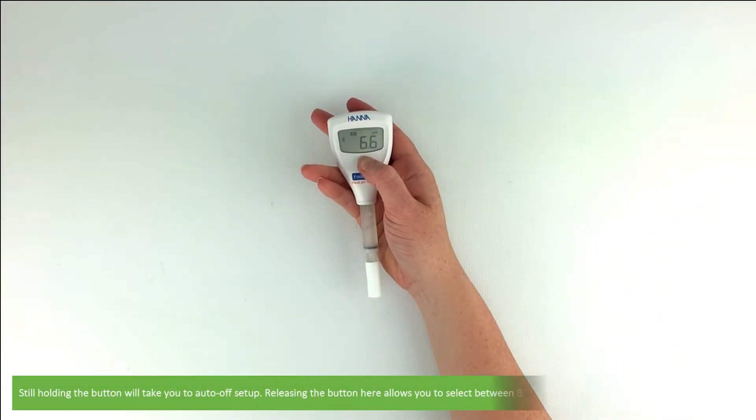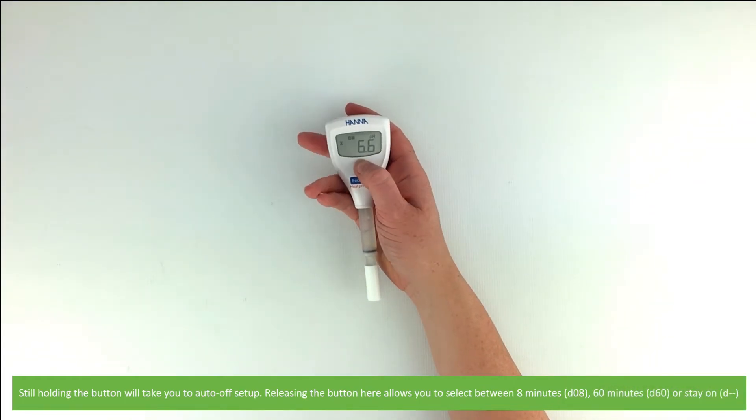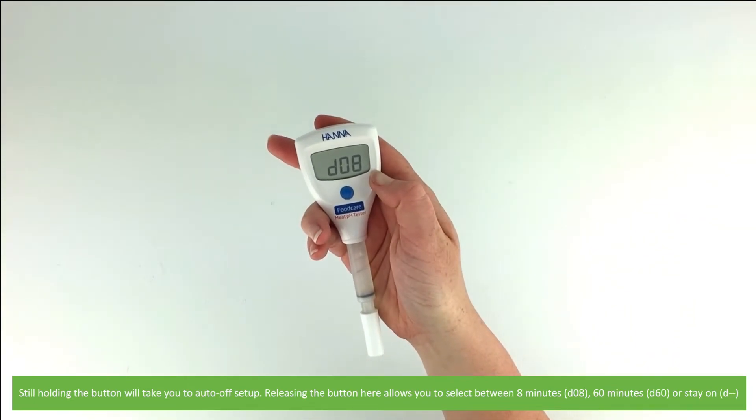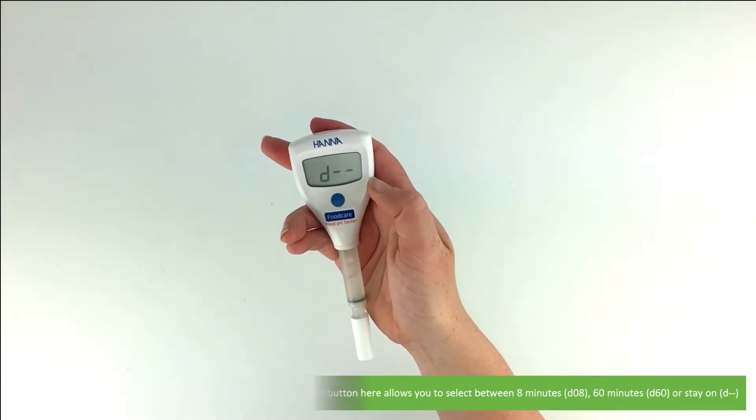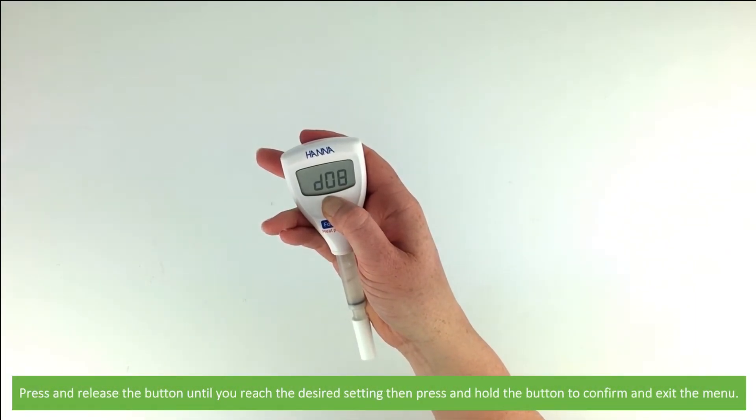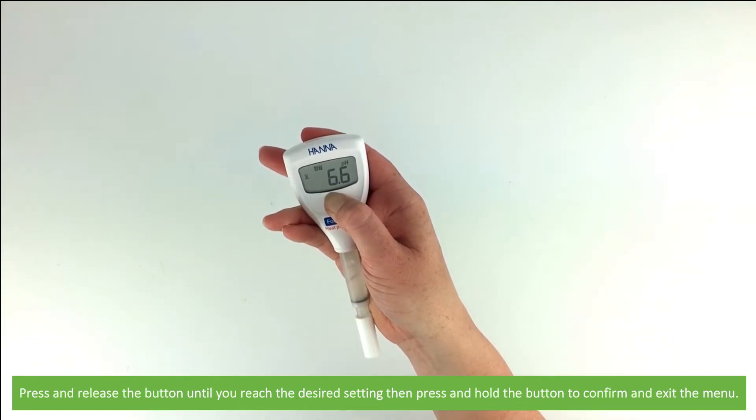Holding the button down for longer will take you to auto-off setup. Releasing the button here allows you to select between auto-off after 8 minutes, 60 minutes, or for the device to remain on. Press and release the button until you reach the desired setting, then press and hold the button to confirm and exit the menu.